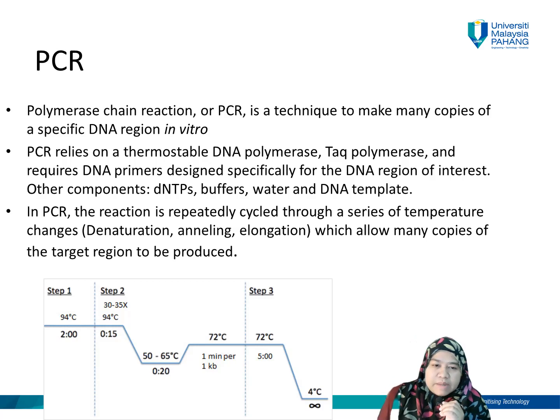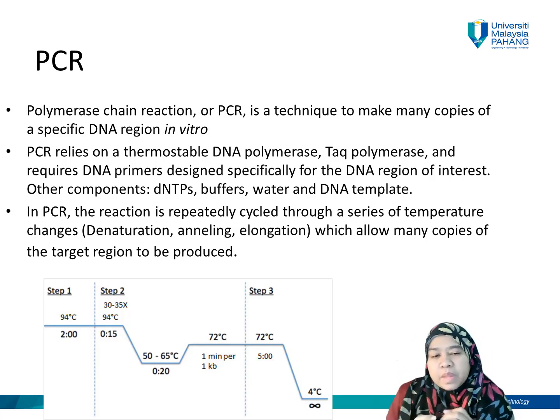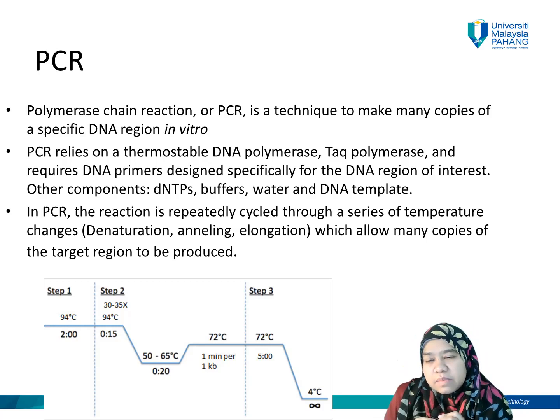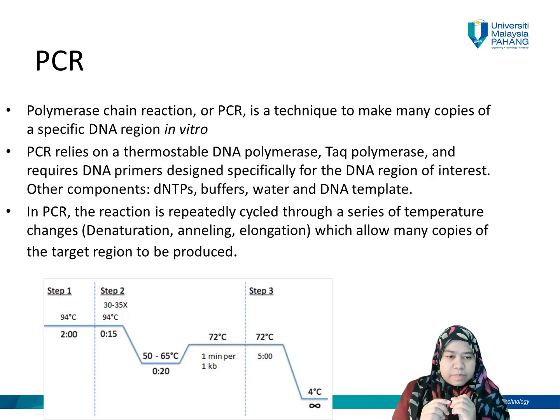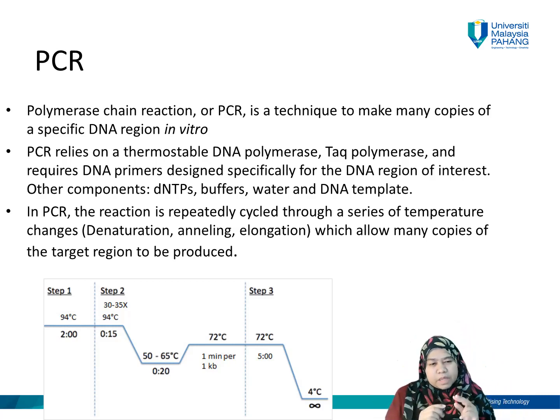Okay, from the diagram, you can see step one is initial denaturation, to reach the correct temperature for the denaturation of double-stranded DNA into single-stranded DNA.